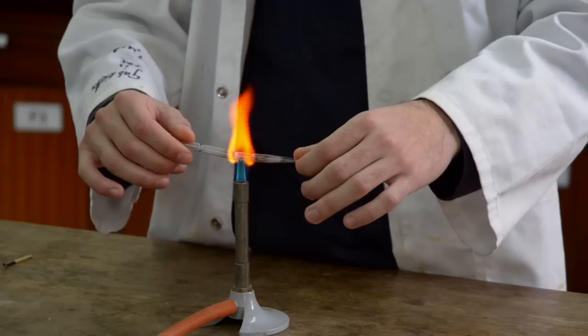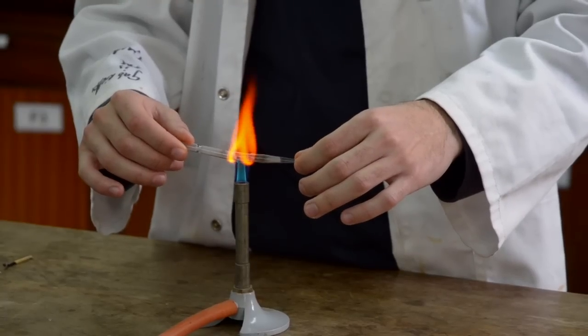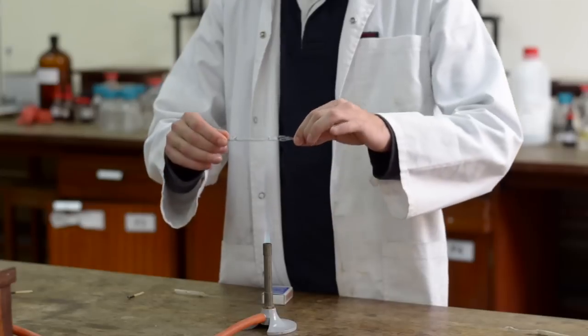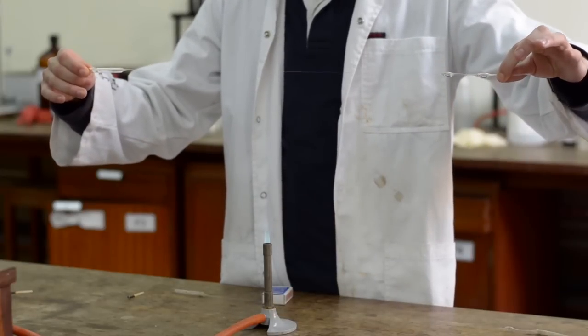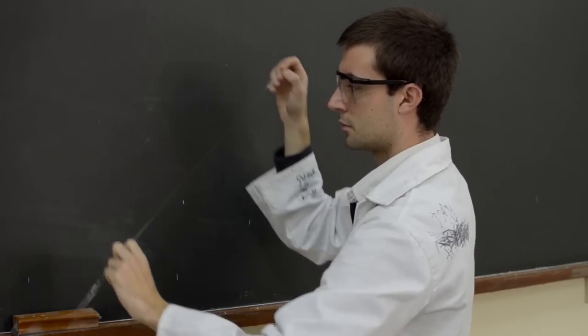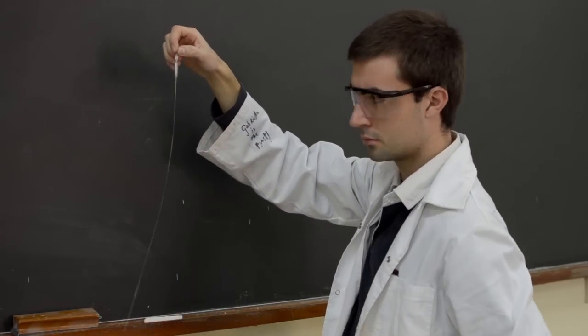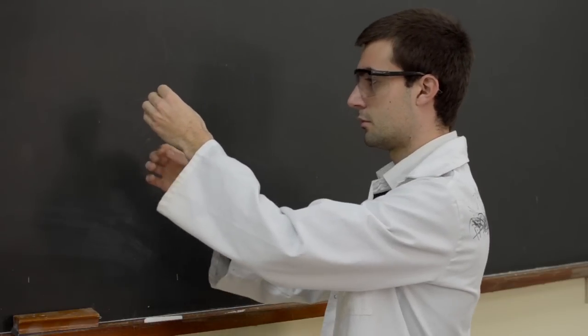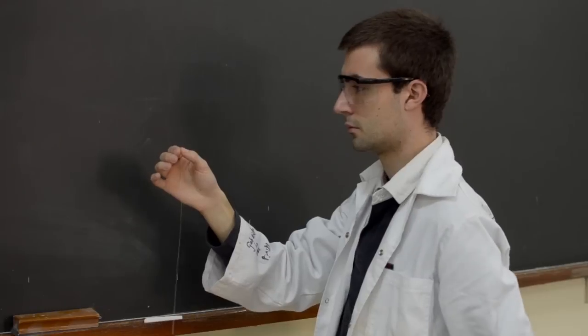This will draw the middle into a thin string-like tube. Don't pull too much as the middle will split. Stretching your hands apart about one meter should be enough to achieve spotters of acceptable thickness. Allow the glass to cool and split the thin sections into spotters of manageable length for easy use.